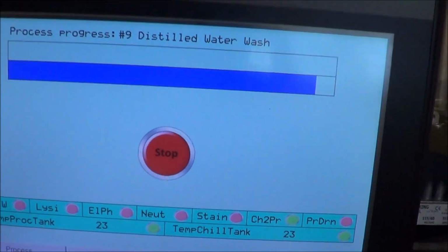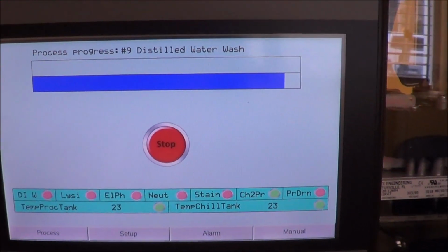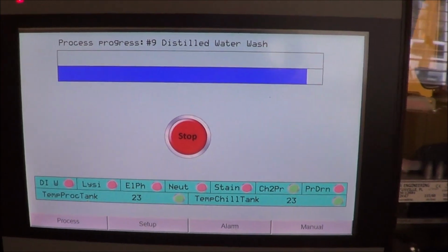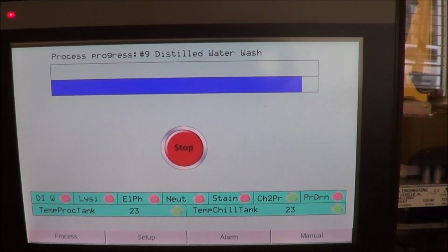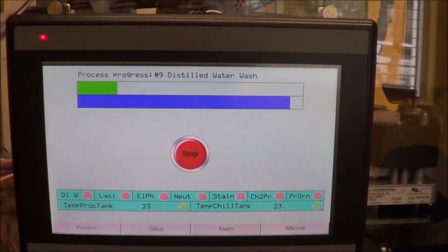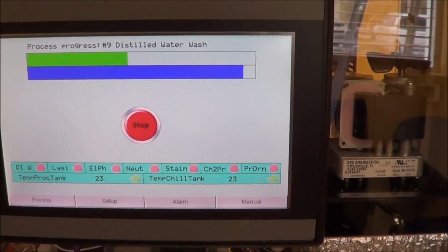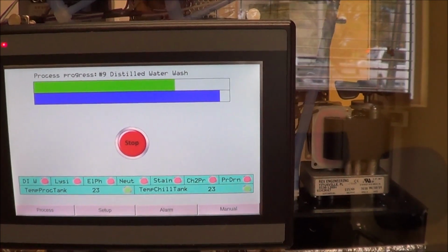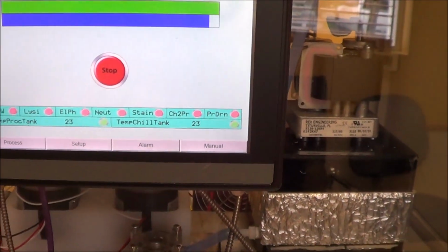So the wash would normally take 20 to 30 minutes. We've got it down to 30 seconds, again, just to move things along. It'll start once the transfer pump shuts down. Go, and there's the timer. Okay, so that's the last distilled water wash. As you can see from the blue progress bar, we're almost at the end of the Comet assay process. Once that timer times out, we'll start dumping the water.